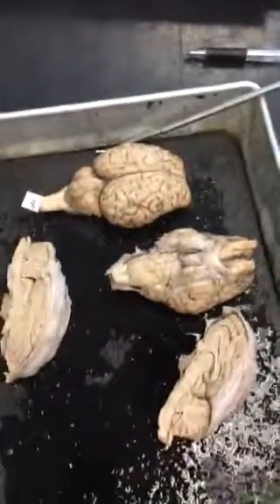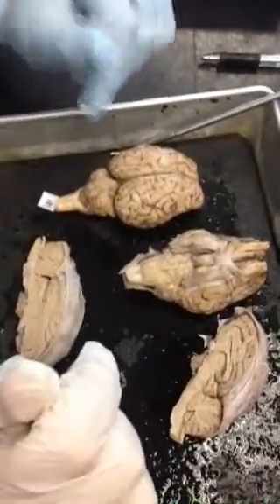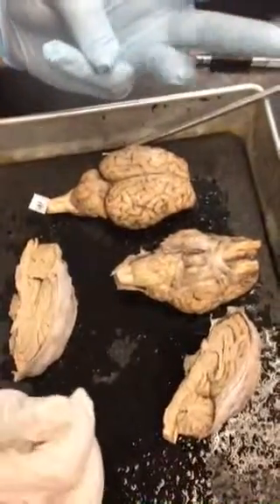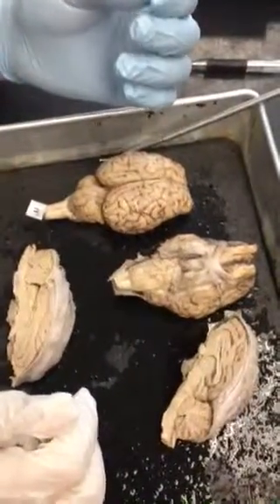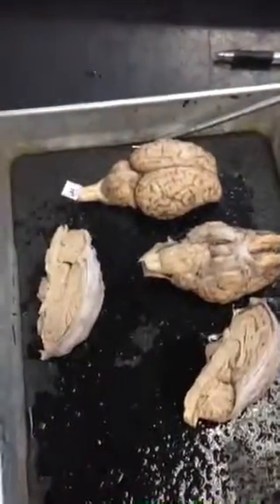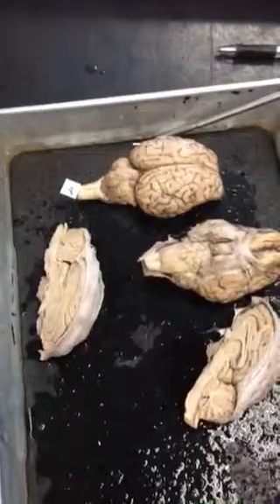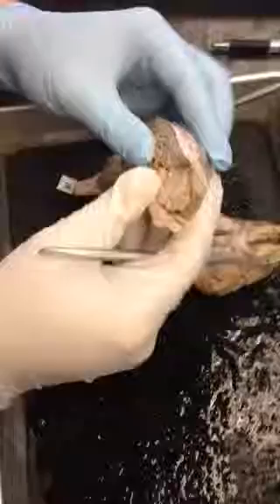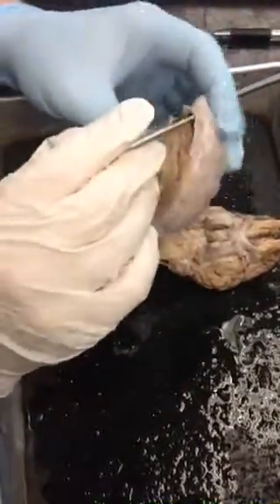The meninges, so what are the meninges? The layers that cover and protect the brain, encase it. What are the three of them? Dura mater, pia mater, and arachnoid. From closest to the brain to farthest away, what are they? Closest to the brain is the pia, then arachnoid, then dura. Dura mater you can see pretty easily. This is the dura mater right here, this white stuff.